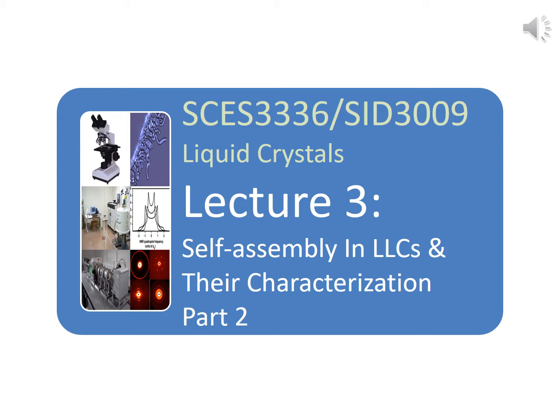The second method is to prepare a sample by knowing the composition of each component accurately. For differential scanning calorimetry, nuclear magnetic resonance and X-ray analysis methods, we have to study samples whose composition is known accurately. Once the liquid crystal region was identified based on the contact penetration study, the formulations at desired component ratios can be prepared. The liquid crystalline material will be added to the required weight of water, or any solvent, and mixed thoroughly to form a homogeneous lyotropic liquid crystal phase.